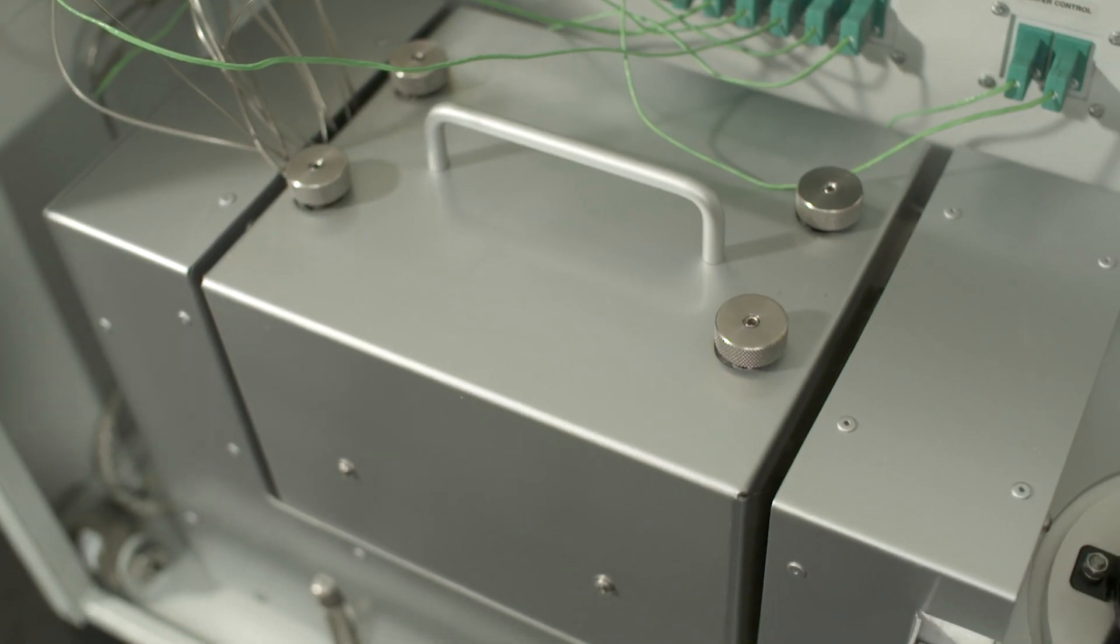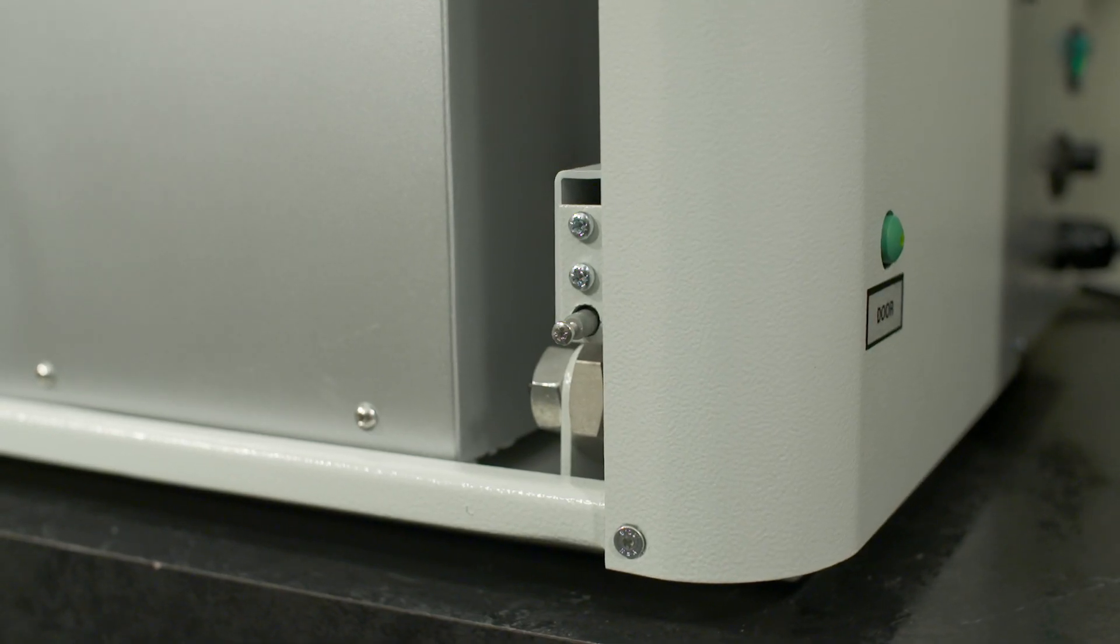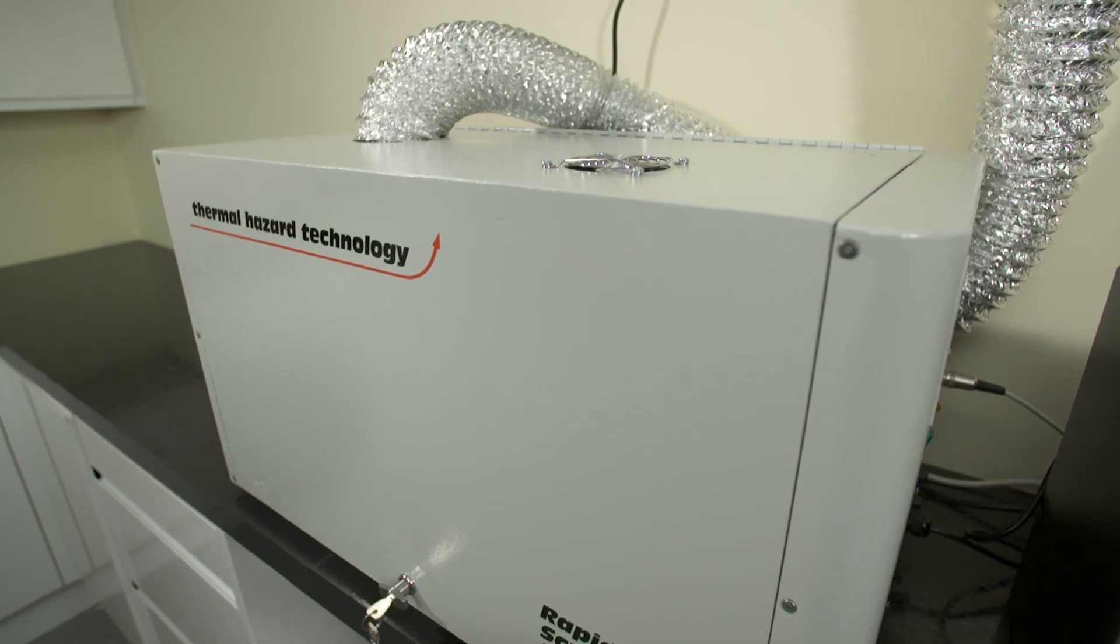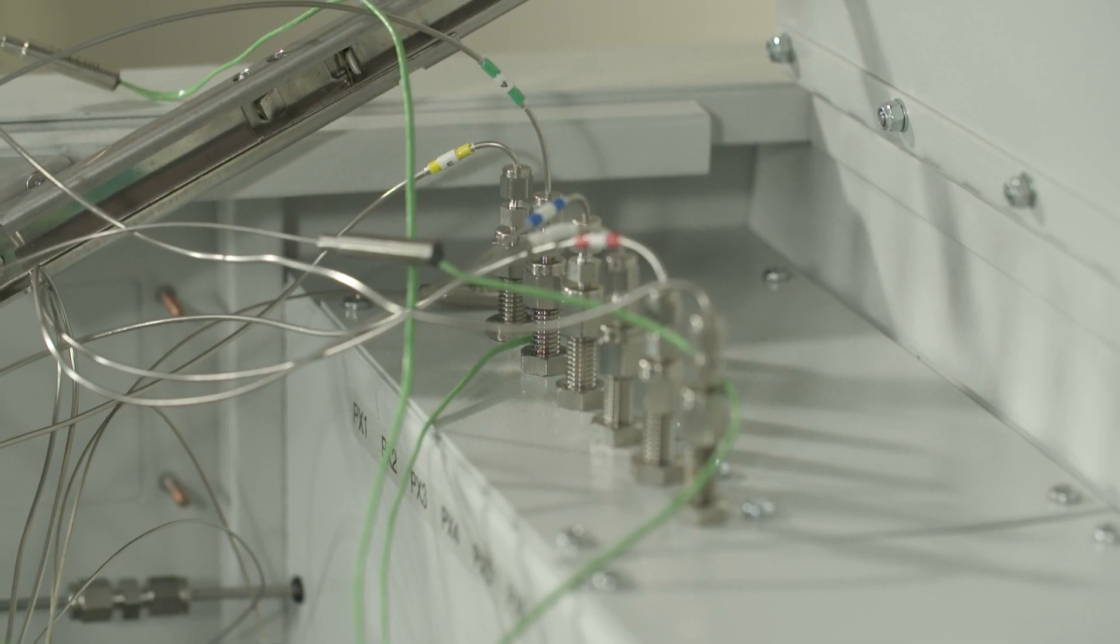The calorimeter is housed within an explosion proof steel enclosure with safety interlocks and a door sensor. An extractor fan removes noxious odours during testing. Six thermocouple connections and six pressure connections are present.